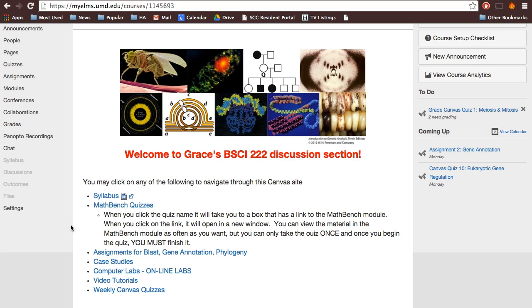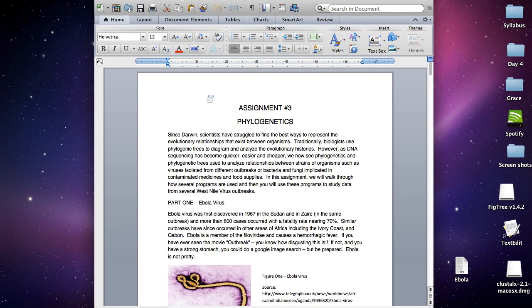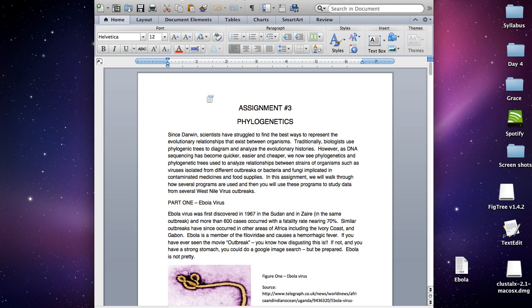Welcome to the phylogenetic tutorial where I'll be going over how to do this assignment. First, you can find the assignment under your TA's Canvas page on assignments. Download assignment number three, phylogenetics. The purpose is to understand how we can use genetics to analyze evolutionary relationships of organisms. In discussion we looked at relationships of different strains of Ebola. For this assignment, you'll be looking at the West Nile virus.